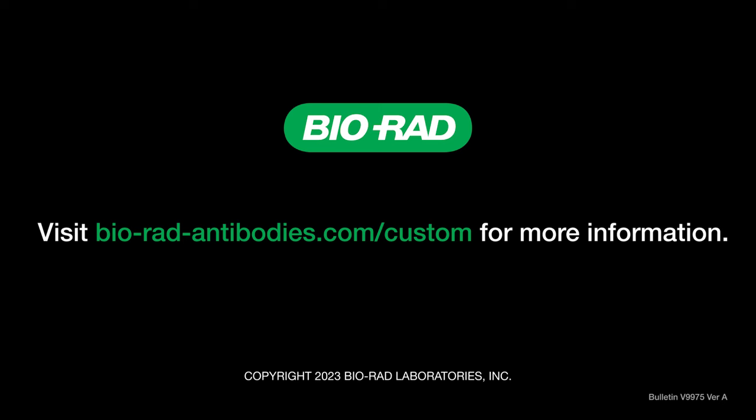Excellent, thank you. Okay, the next question is, can SpyTag antibodies be used in vivo? Okay, that's a great question. So we don't advise that they're used in vivo. The reason for this is because the Fab portions themselves are E. coli derived, so there will be endotoxin present because of this, which could cause downstream issues when used in vivo. There's also a possibility that the catcher itself might be immunogenic, as it's derived from Streptococcus pyogenes. And so for this reason, they're not really suitable for in vivo applications and work better in vitro.